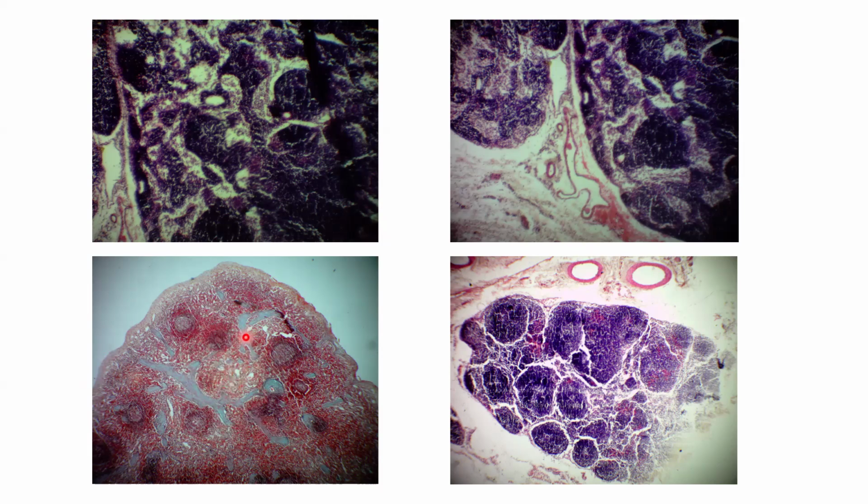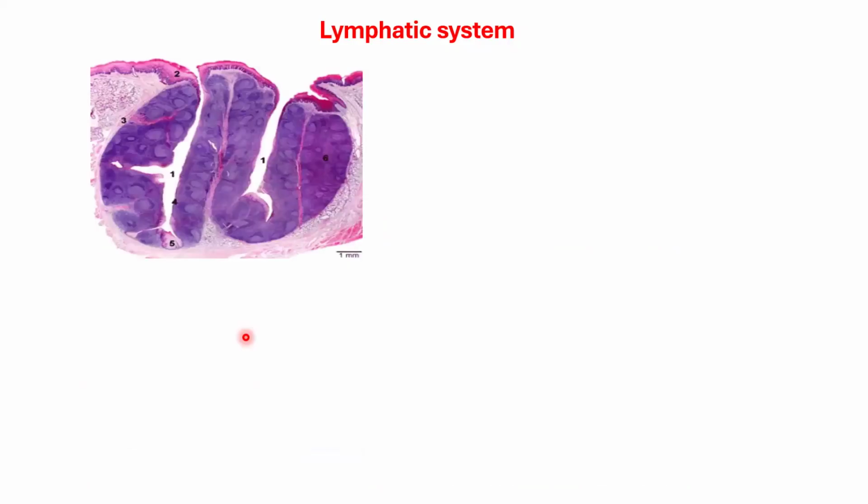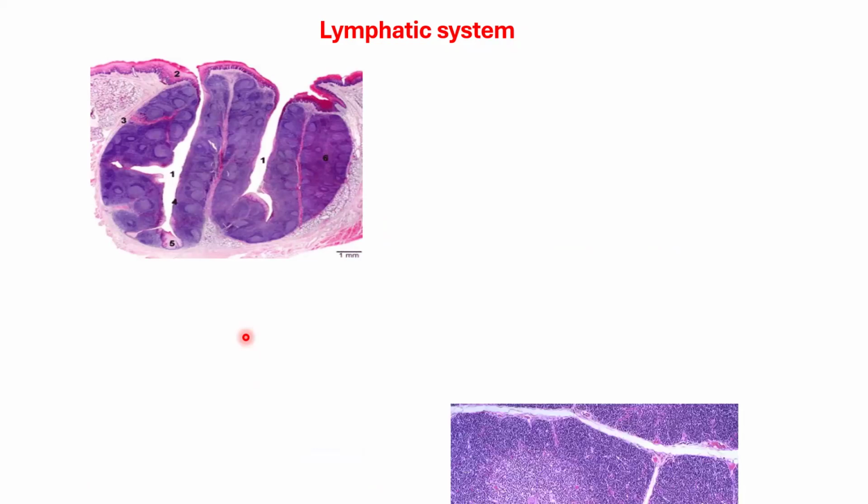Here's our red one, and that's a slide on the spleen. It comes a lot in exams. What about this? I hope you made the correct answer. That's the palatine tonsil. We had gone through it, so I won't belabor much on it.